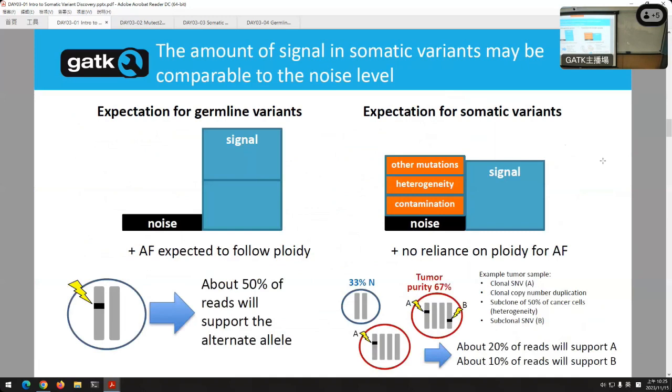I mentioned this on the first day, and I'll say it again. When you think of germline variants, the stuff we've been doing for the last 2 days, well, we know there's noise. We talked about all the filtering we've had to do because there's contamination, or the sequencing isn't perfect, or the human reference is not perfect, or your reads are short. So there is noise on the germline side, but there's a lot more noise when it comes to cancer.